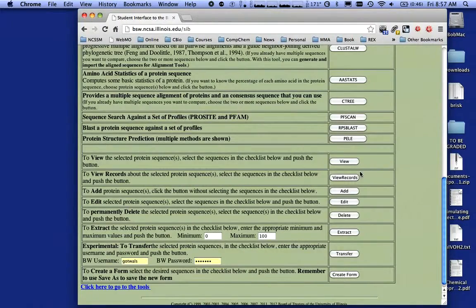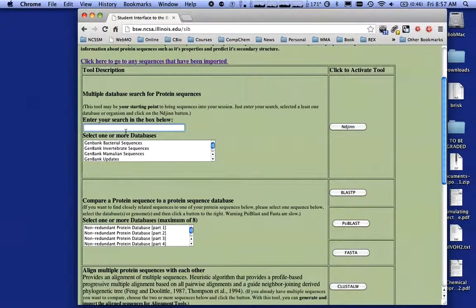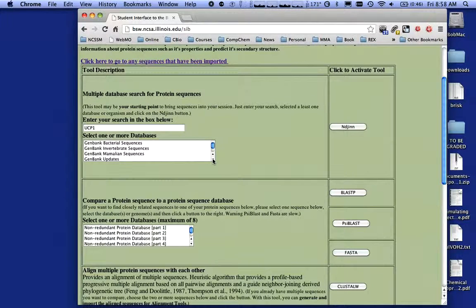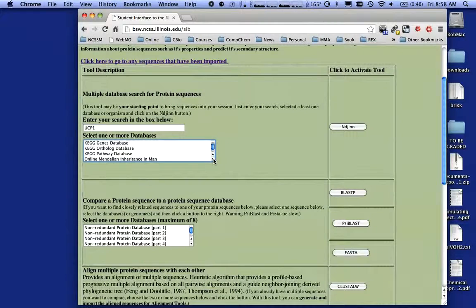I can view a sequence that I download, look at records, and delete things if I want. I'm looking for a protein called UCP1 and want to search for it. Notice there are a variety of databases available. The big one at the top is GenBank, with different versions for bacteria, invertebrates, mammals, and so on. Scrolling down, there's another set of databases called KEGG — the Kyoto Encyclopedia of Genes and Genomics — and OMIM, the Online Mendelian Inheritance in Man database, which is up at NIH.